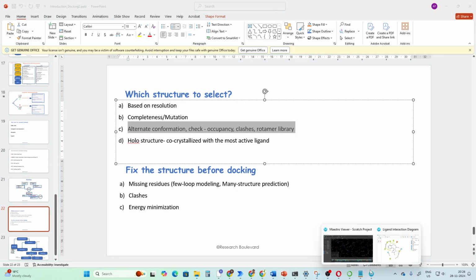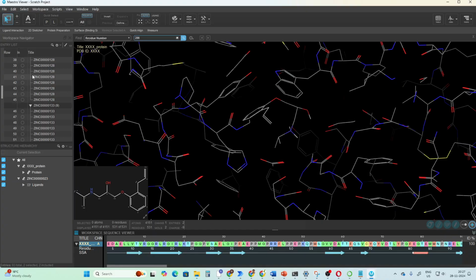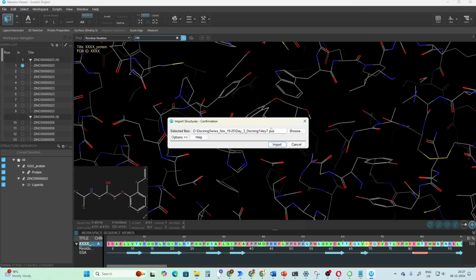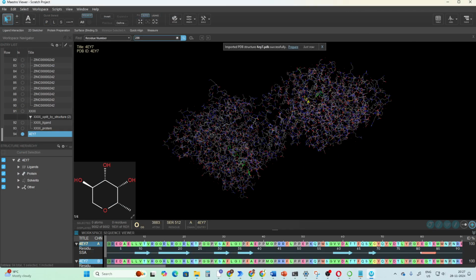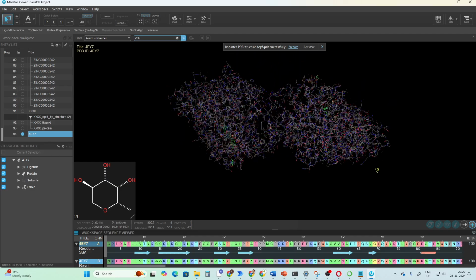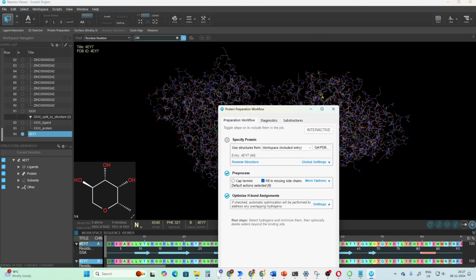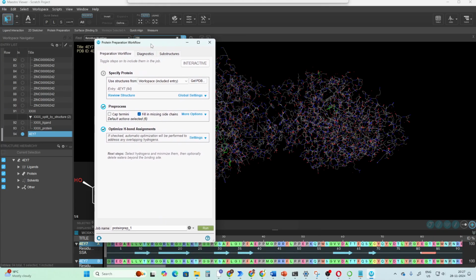So what you can do is, let me just give you an example. Let's take the same molecule over this one. Okay, let's open it. So let's go to this protein preparation wizard. Let me show you what I am trying to say.